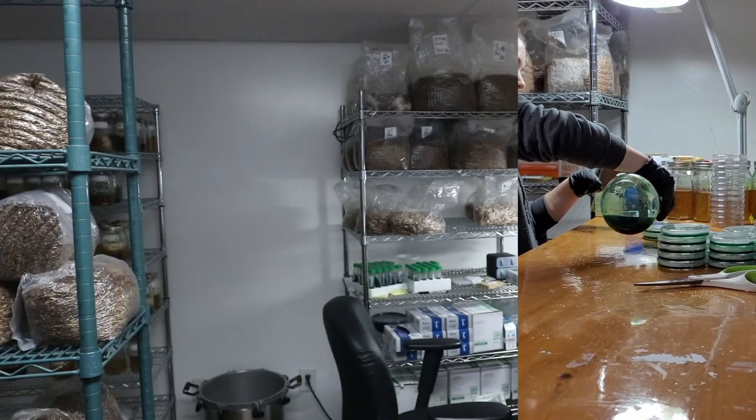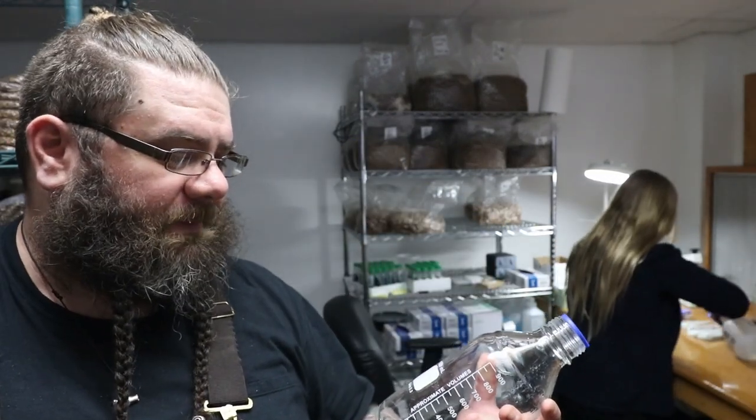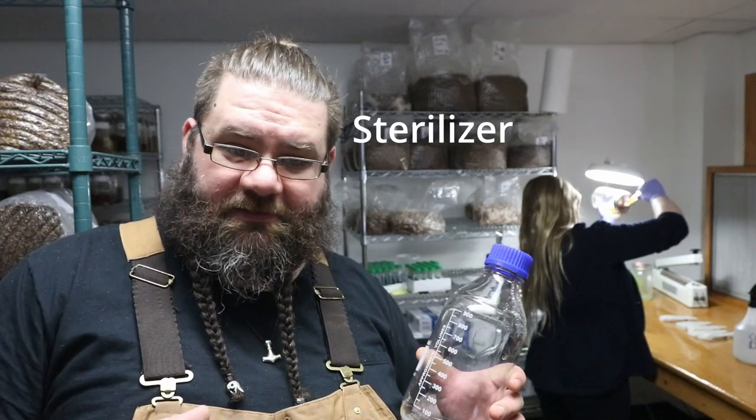Another thing that you can go with is something like these media bottles. It's just literally called a media bottle, and you can buy them, I think, in 2 liter, 1 liter. This is a liter here. I really like these as well. The flask I find a little easier to pour, but one of the things we started doing is we take our media bottles and cook our agar in there and then just let it sit overnight, completely cooling in the autoclave. Then we have these sitting on the shelf with agar in them until the day that we're ready to pour plates, in which case we just stick this back in the autoclave and heat it up for a little while. I don't even fasten the lid, I just use it to warm this up. Once this is warmed for a couple of hours, it's ready to pour. And it's still sterile because it's kept in a bottle that maintains that sterility.